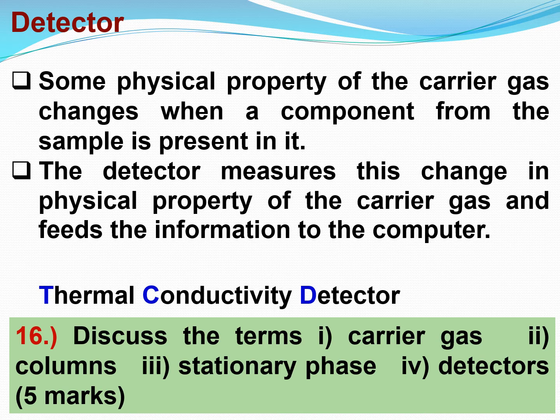So one important question: discuss the terms carrier gas, columns, stationary phase, detectors. Discuss the terms, means just you can define what is a carrier gas, what is column, all that you can define.